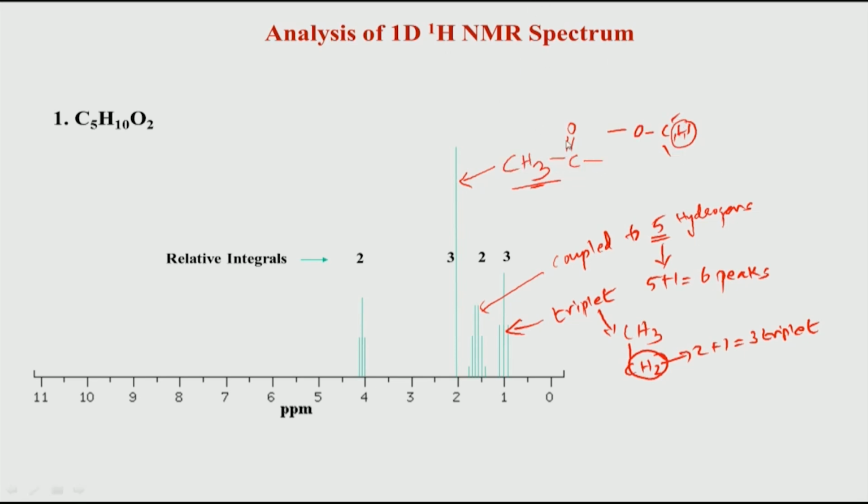the molecule which satisfies all these conditions, now that we have looked at the different peaks here, will be this. So, now let us look at how this can be interpreted. This is a CH3 peak, which is an isolated peak, not coupled to any hydrogens. We looked at this, and because it is attached to a carbonyl group, the CH3 peak, which typically comes between 0 to 2, comes at the downfield part.